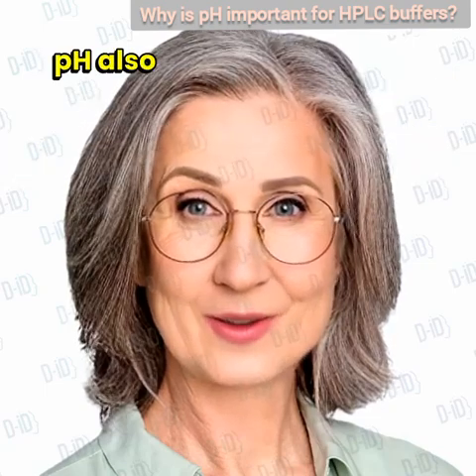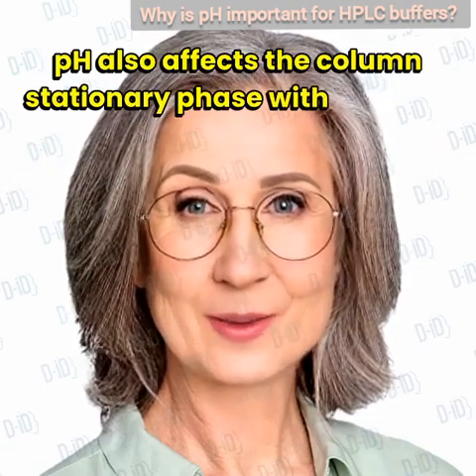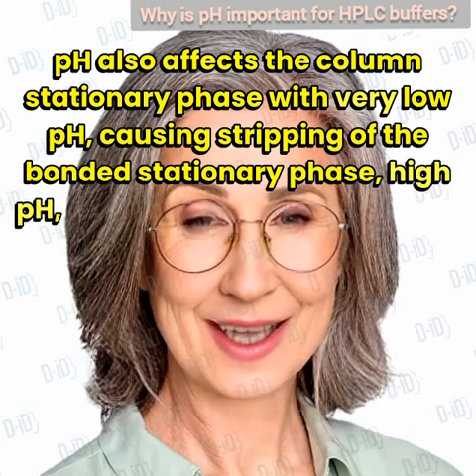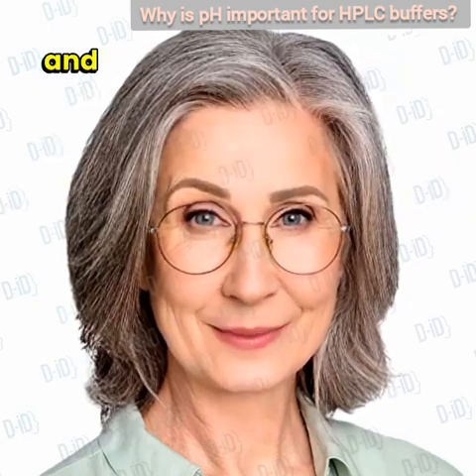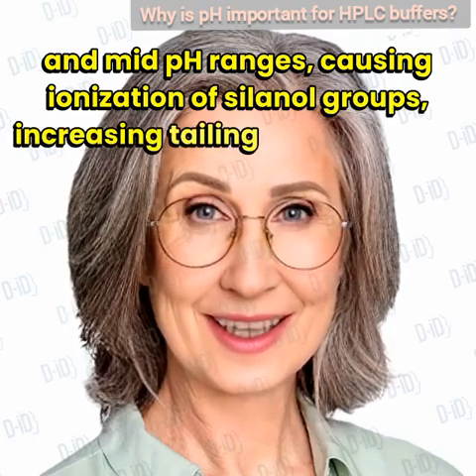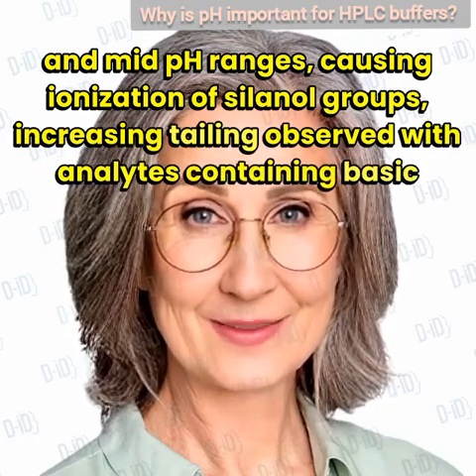The pH also affects the column stationary phase, with very low pH causing stripping of the bonded stationary phase, high pH damaging the silica support, and mid-pH ranges causing ionization of silanol groups, increasing tailing observed with analytes containing basic functional groups.